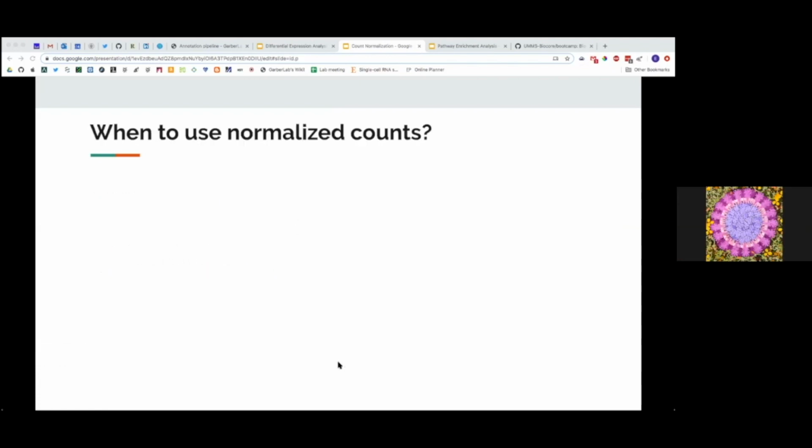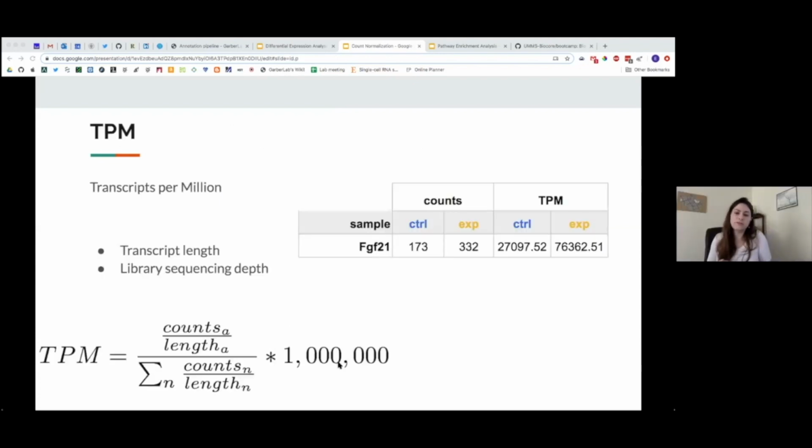So just a quick question about counts. Yep. Is counts the number of reads associated with a particular gene, or is it the number of times the gene was identified in the small reads? So in the case of everything we've been saying here, that's kind of the same thing. It is the number of reads you saw for that gene.